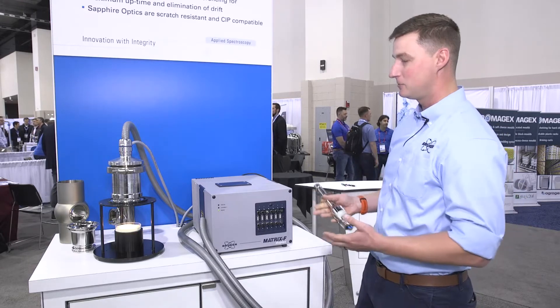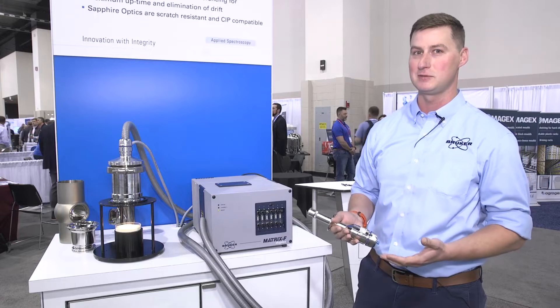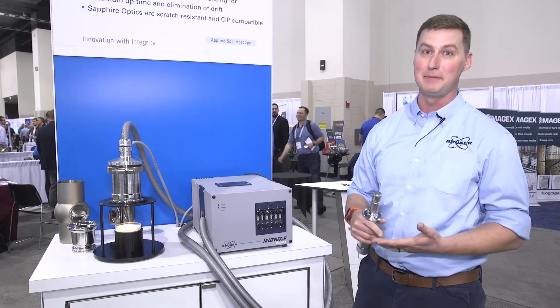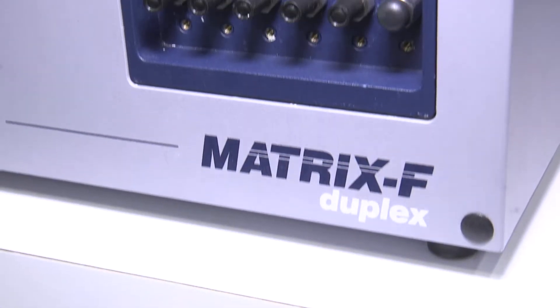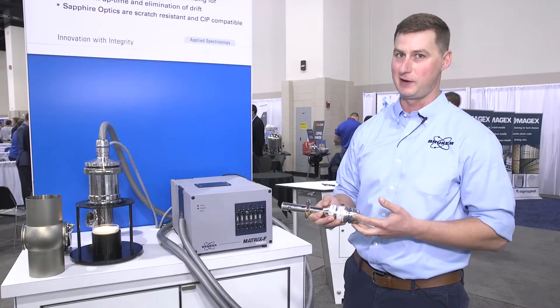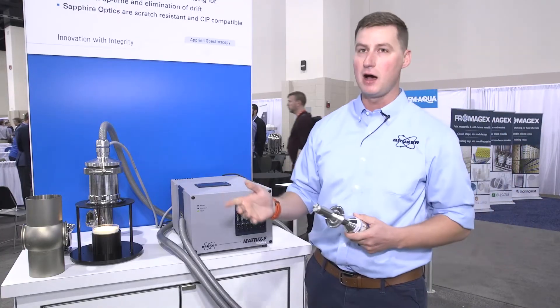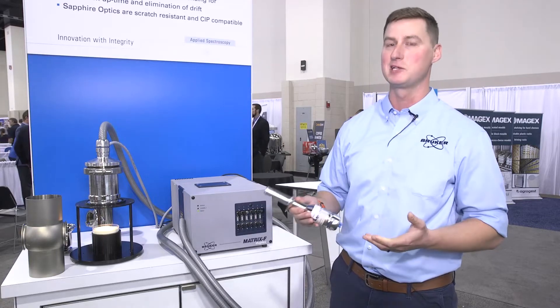This analyzer uses the same FTNIR technology as our benchtop systems, which means you can expect the same reliability, repeatability, and stability over time. Probes are specifically designed for the dairy industry with 3A standards in mind. Depending on where in the process we want to analyze, we'll recommend a specific probe.